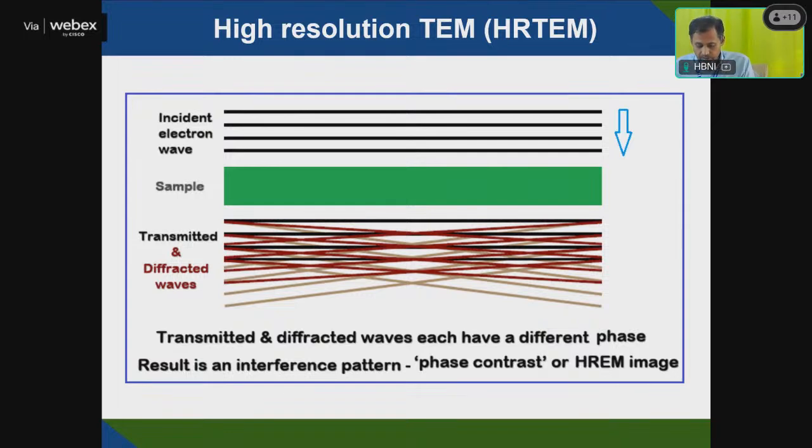In dark field, the diffracted beam comes into play, and in STEM you have the raster scanner that is scanning. In EELS, the electron beam energy loss is coming, how much energy is getting lost. From there, you can get information about oxidation state, and that near edge and extended edge structure where you get the information about oxidation state and coordination number.